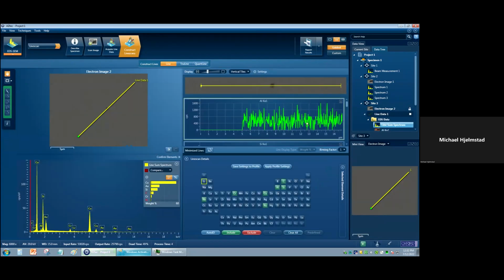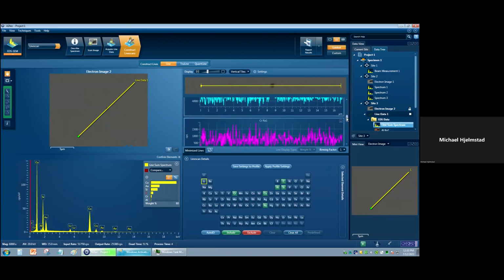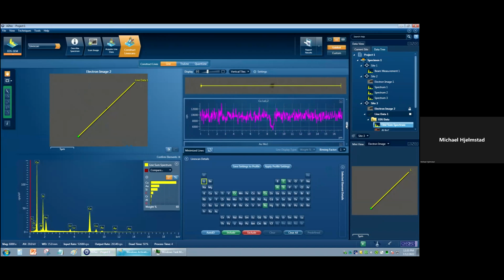I can look at this line scan all day and go, is anything really changing? It looks like something's going up. The copper layer is a lot lower there. Yeah, it looks like it may be a defect in the structure just based on what we're seeing on the copper signal. But again, quantify that for me. That's where we're really going with this. So, with a line scan, we still have a couple minutes here. Let's let it acquire for maybe another 30 seconds, and I'll pull a spectrum off that.